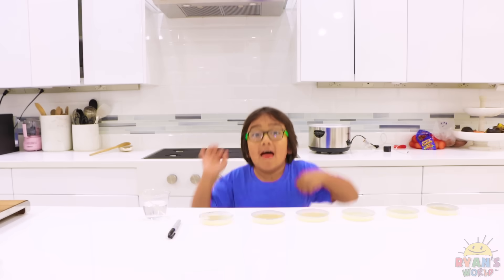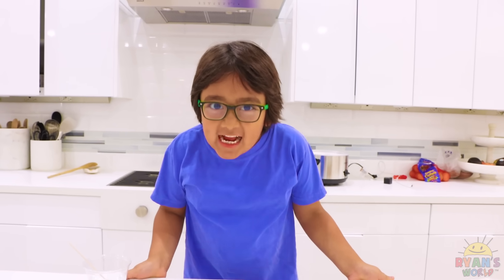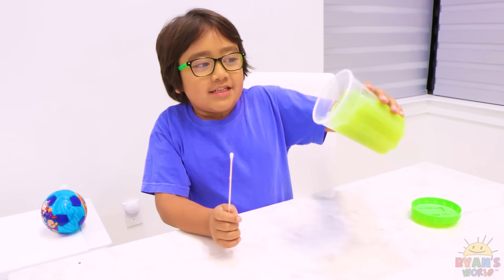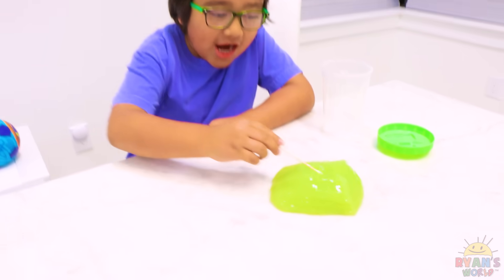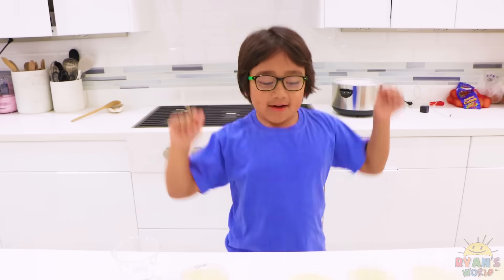Next, I love playing with slime, so we're going to see if my slime has bacteria in it. This is the slime I've been playing with, so technically it's probably a little bit of my hands in the slime. Now let's put it on an agar plate.